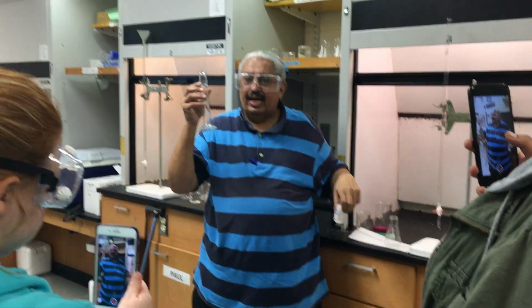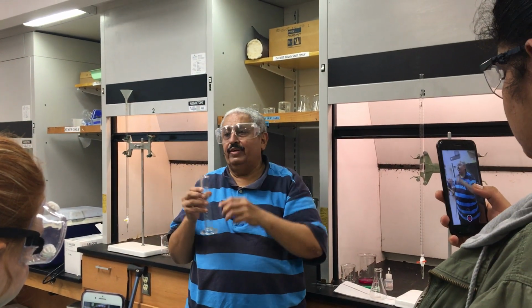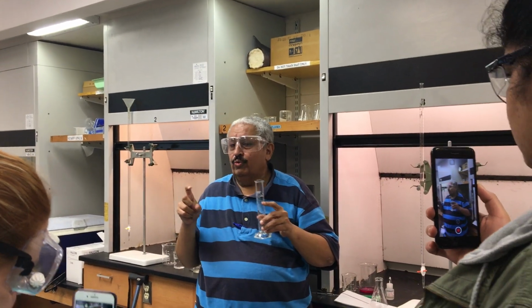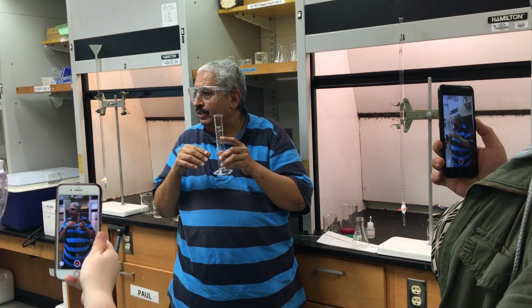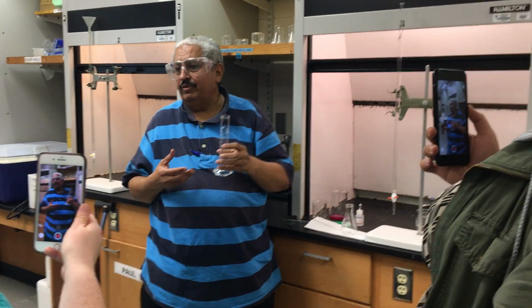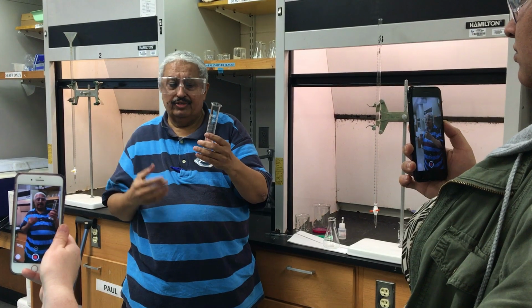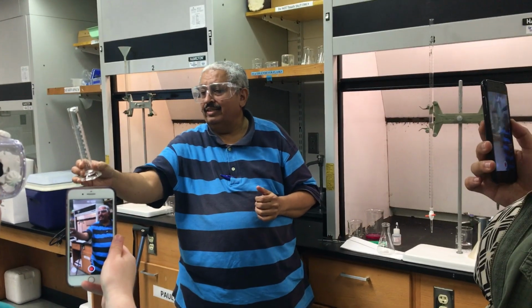So, regardless of whatever H2O you use, suppose somebody will use 100 mL. Does it affect the molarity? No, because we are calculating number of moles. We are calculating what? Number of moles. So the number of moles is not affected by the H2O that I am adding. The H2O I am adding is just to help me visualize the pink color from no color to pink, so I can see it much better. So I need somebody who will volunteer with 10 mL of distilled H2O.